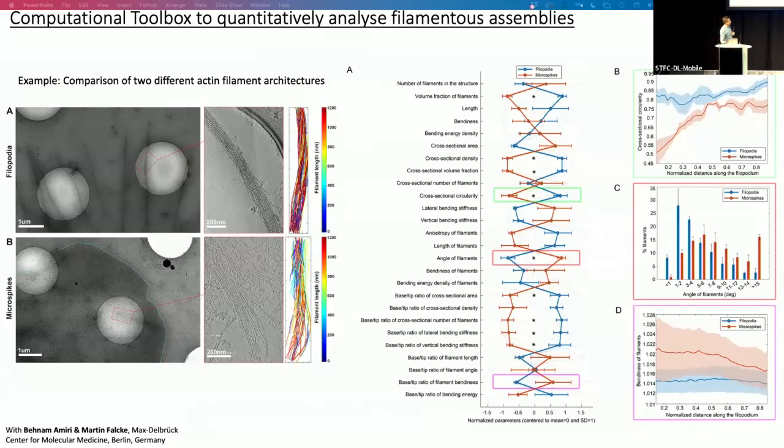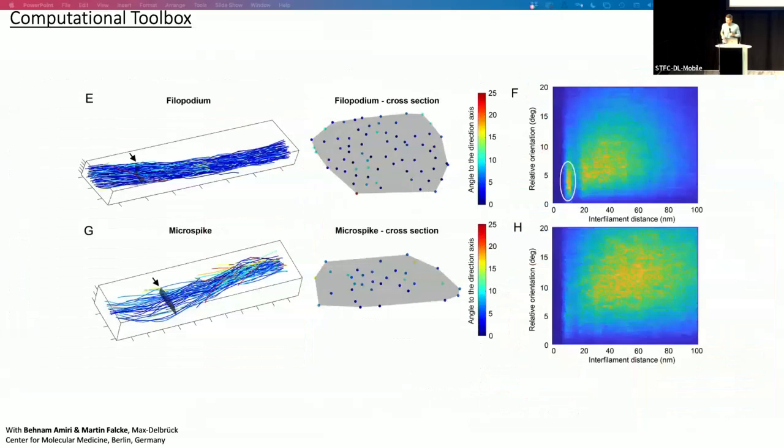And what we can also do is use information to understand how filaments are oriented in relation to each other, how they are distanced, how they are in angles to each other, to eventually pipe this into processing pipelines later on to use this as a classification tool of geometry, where the geometry, as I mentioned, tells function, which means it must be related to the presence of specific proteins. So this is something that we want to go to.